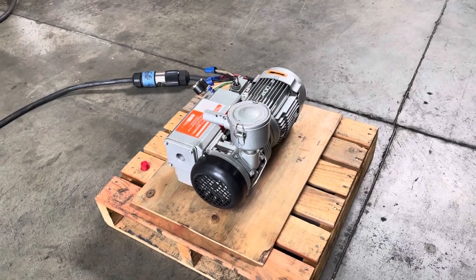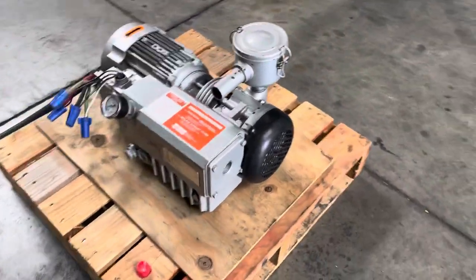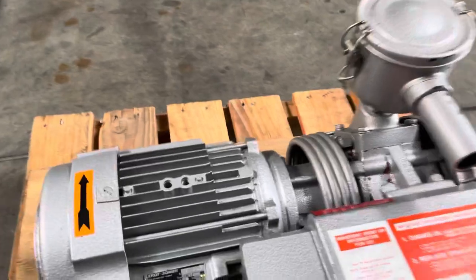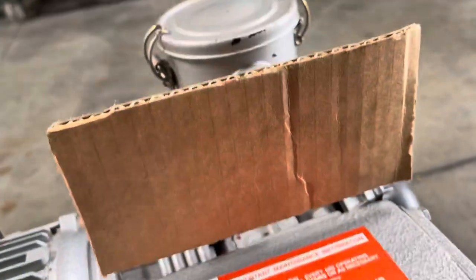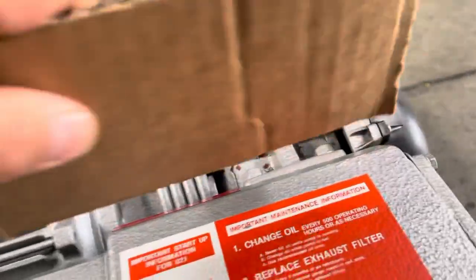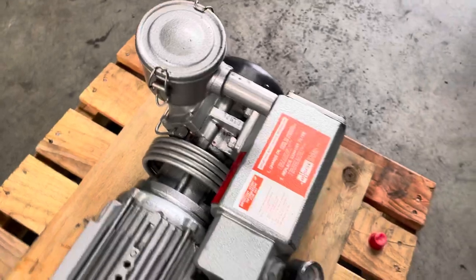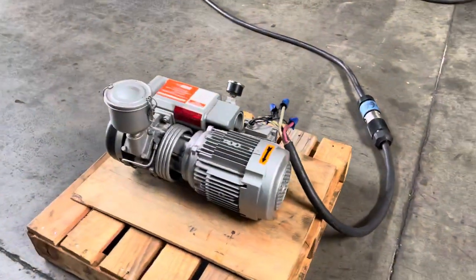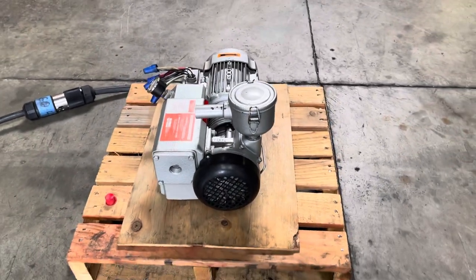Here we have a Busch one horsepower rotary vane vacuum pump. We got it hooked up to 460 volt three phase power and we're going to turn it on and show you that it works. That right there is the suction — you can see where it holds. That is the Busch one horsepower vacuum pump.